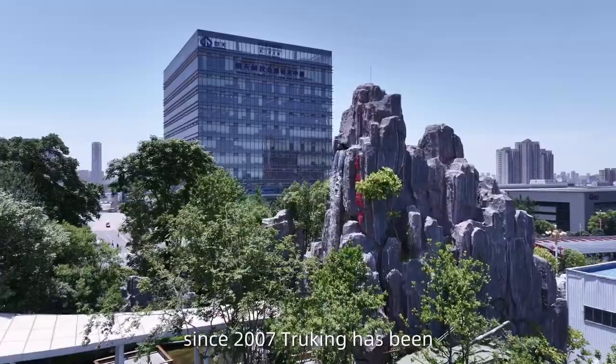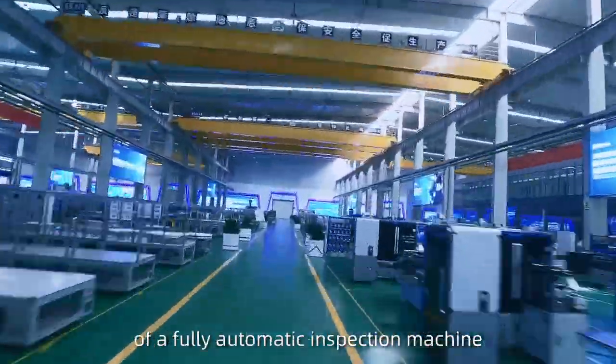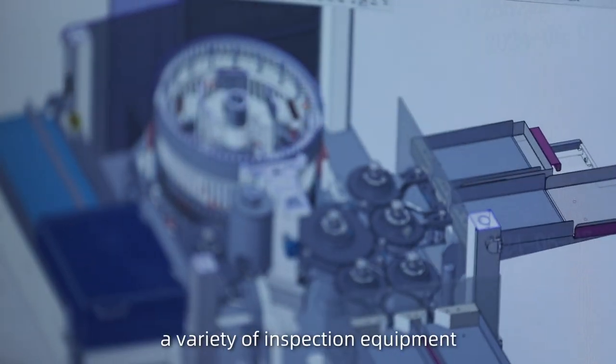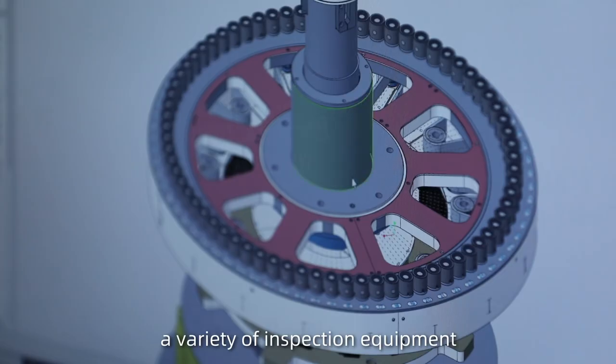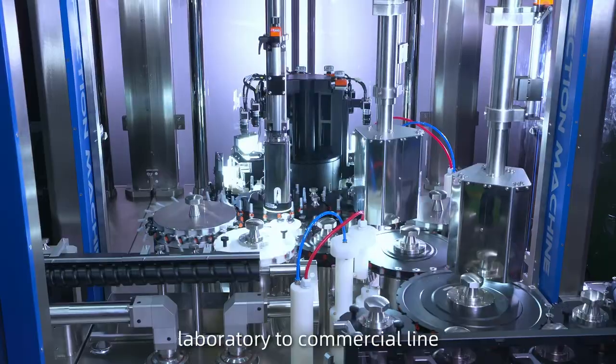Since 2007, Truking has been engaged in the research and development of fully automatic inspection machines, and now we can provide a variety of inspection equipment covering the whole process from laboratory to commercial line.